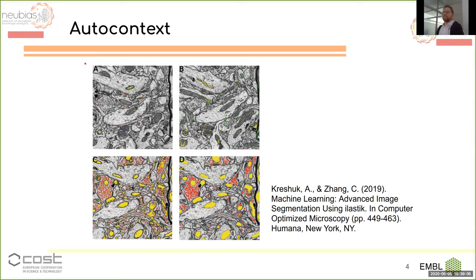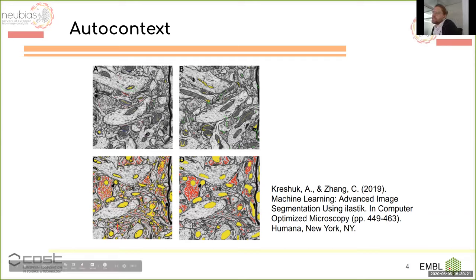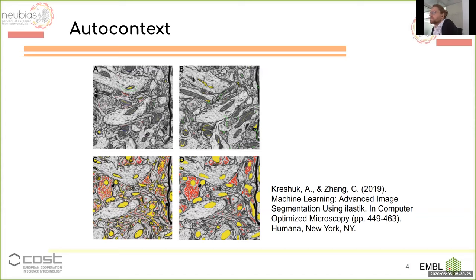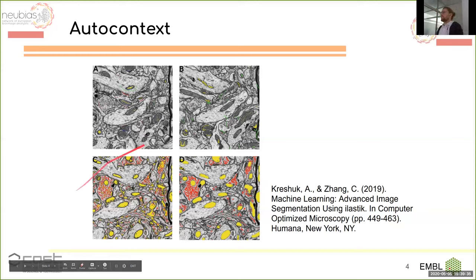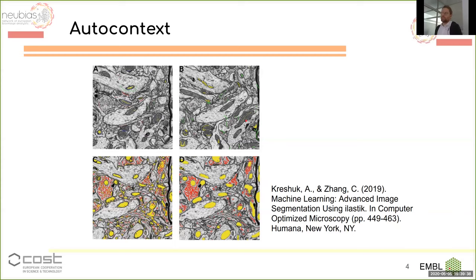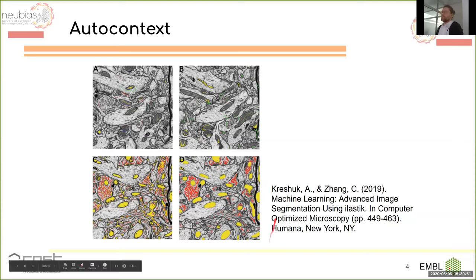AutoContext is like pixel classification, but you do two rounds of pixel classification. On the left you see annotations on the top and predictions from the first round on the bottom. The task was to find vesicles and mitochondria. It works somewhat, but in some areas you get overlapping results. In the second round of AutoContext, you do the same as pixel classification but on the predictions produced in the first round. You give a new set of annotations and the predictions get much cleaner.